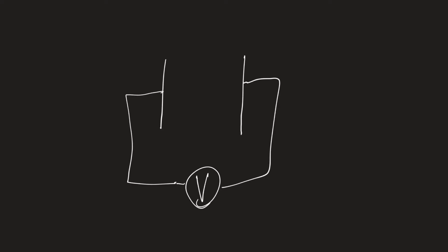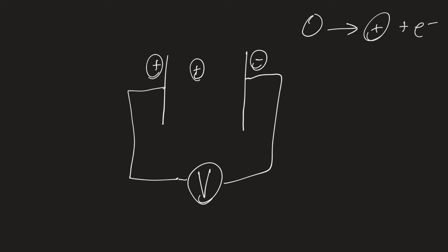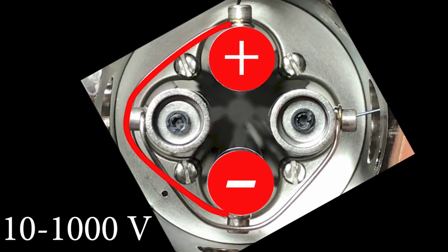So a quick throwback to what we looked at with FID detectors. We can apply voltage to different plates, a positive and a negative. We're going to get the positives attracted to the negative, negatives attracted to the positive. In this case, we're pushing around positive ions for the most part. We're definitely not pushing around electrons. Instead of plates now, we're talking about poles, but we're going to apply a voltage to the poles such that with this pair of poles, one of them is going to be positive and one of them is going to be negative.